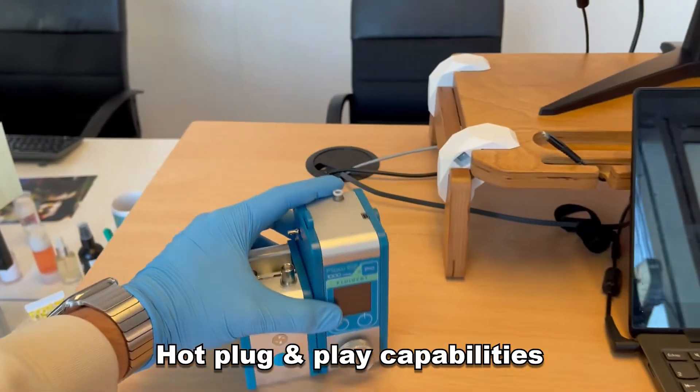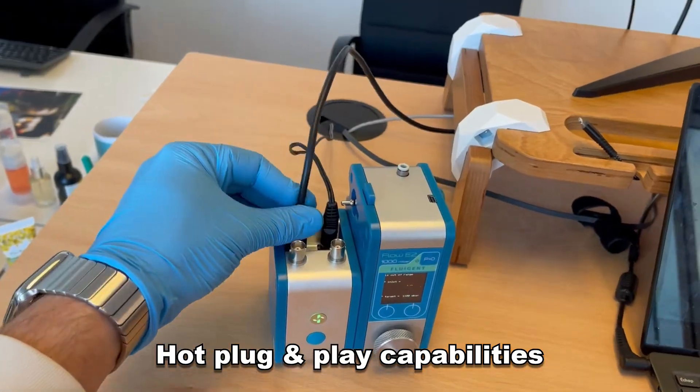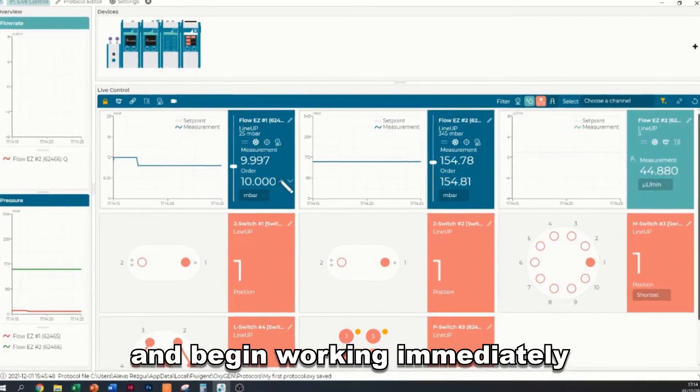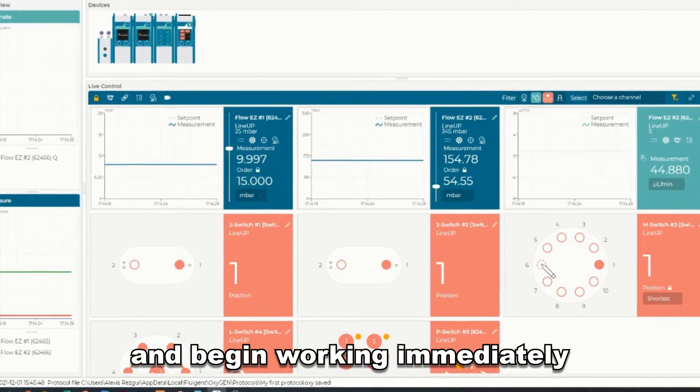Hot plug-and-play capabilities allow one to connect their devices and begin working immediately.